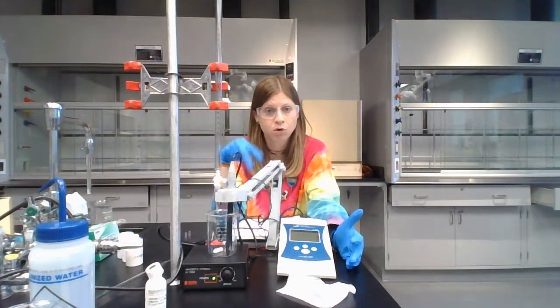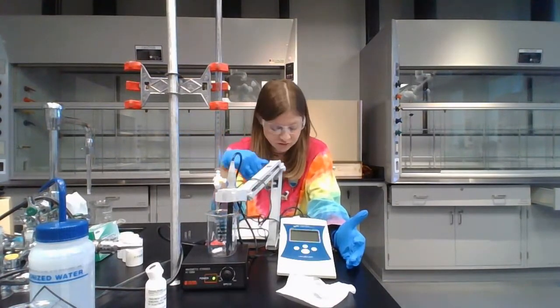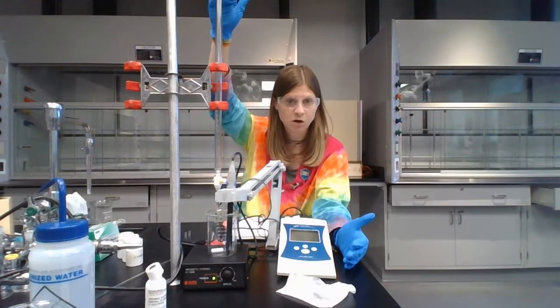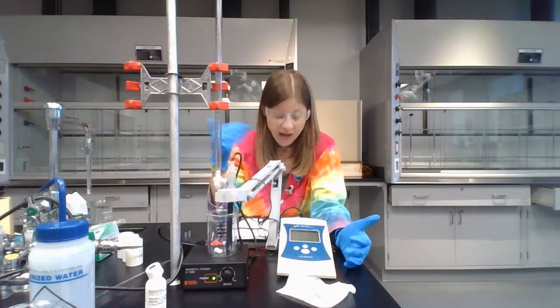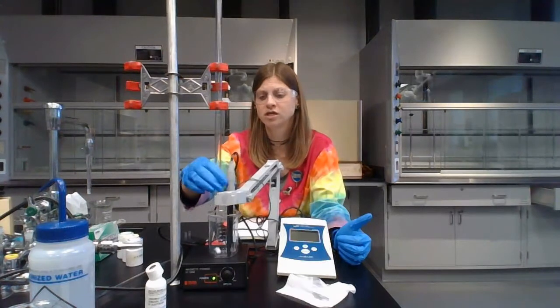So the two things we're recording are the milliliters of sodium hydroxide and the pH. Your first entry for the milliliters of sodium hydroxide for trial 1 is going to be 0.00, because our burette says 0.00. And then you're going to record the pH right next to it once this whole setup is there.